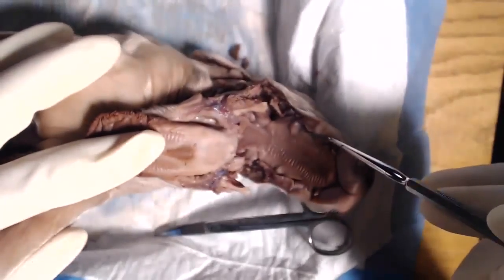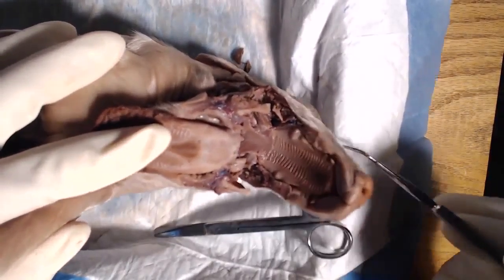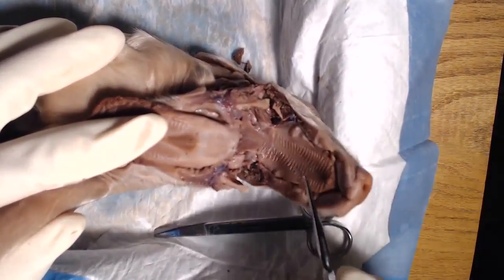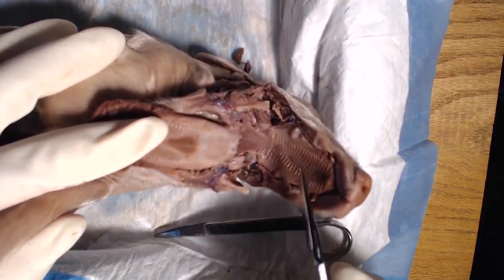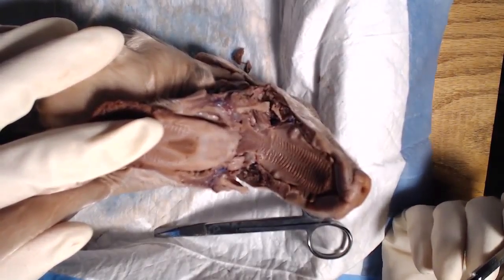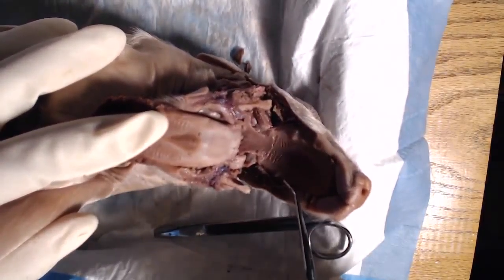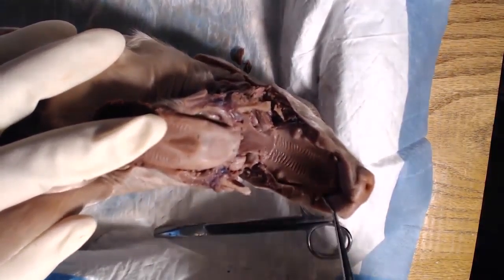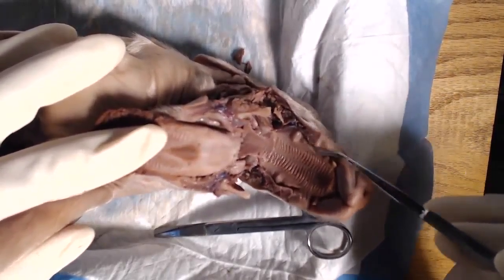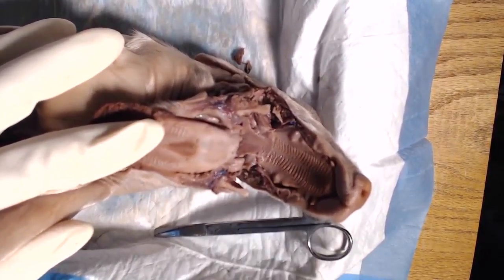Also, while we're looking at the roof of the mouth, you can see that these fetal pigs already have some teeth erupting. Here, you can see one here. We can see some coming through in the back here. And this is interesting because obviously in human babies, they're not born with any teeth. So it's interesting that these fetal pigs already have their teeth coming through. So go ahead and try to identify the hard and soft palate and the teeth in your pig.